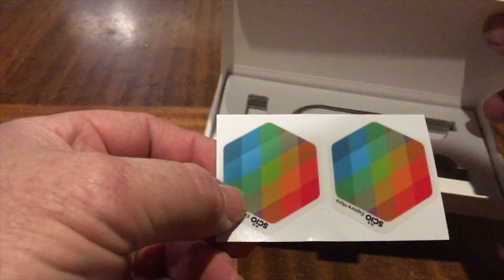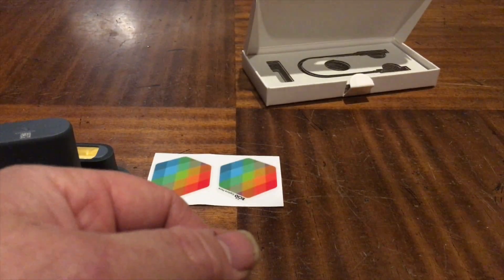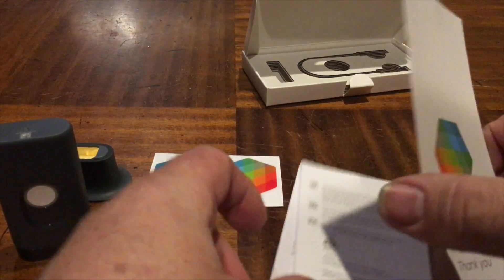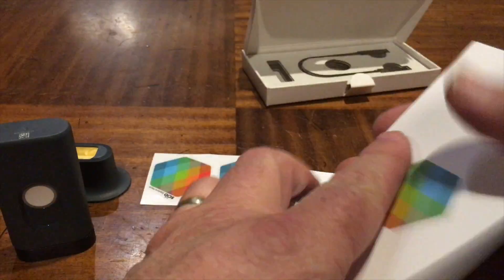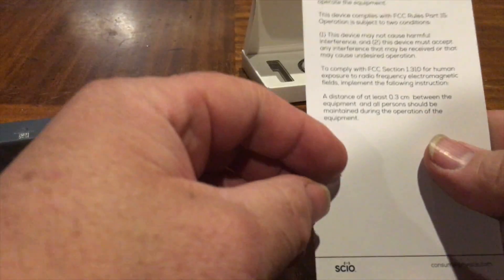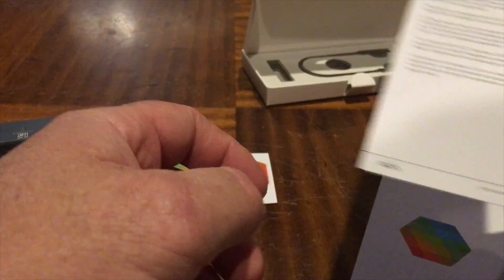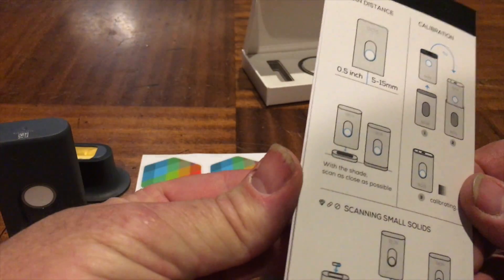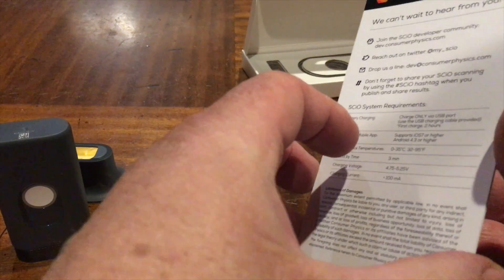Some stickers for the computer - nice. Safety and regulatory info - yeah yeah yeah. FCC compliance - don't change your device or they will hunt you down. And here's how to use it.